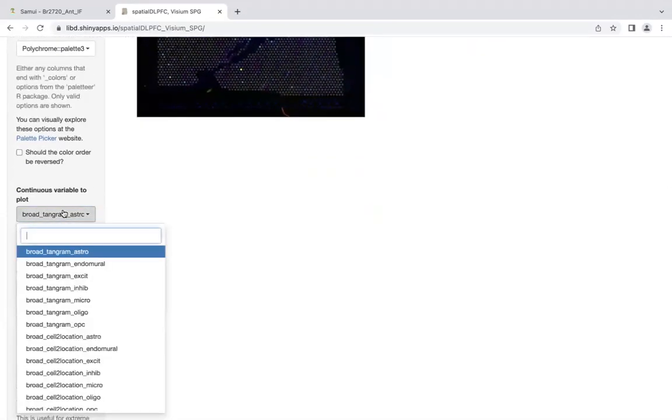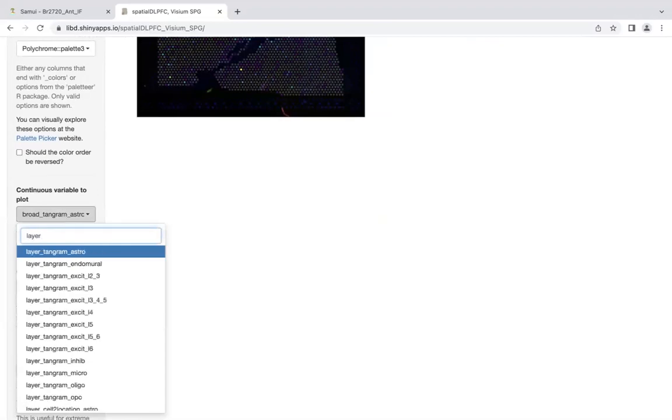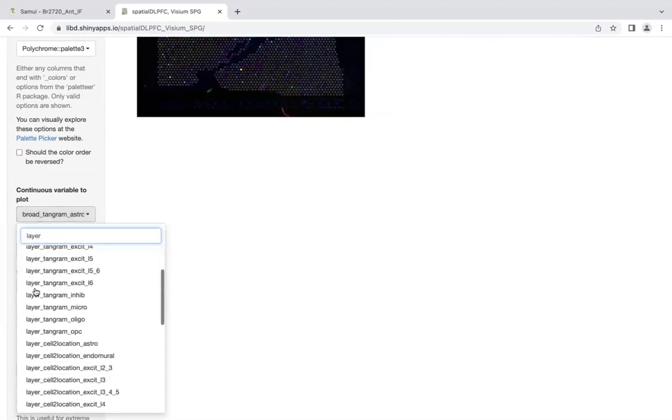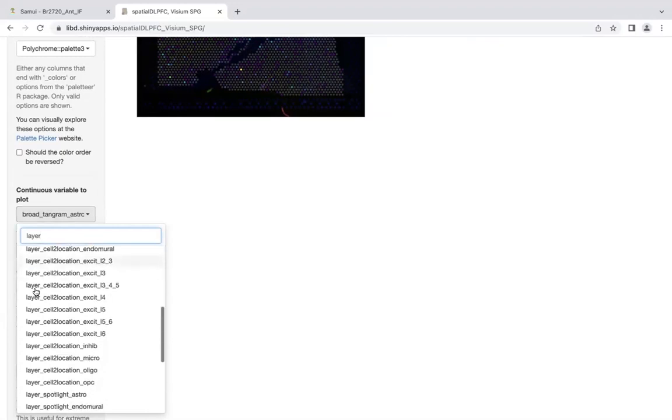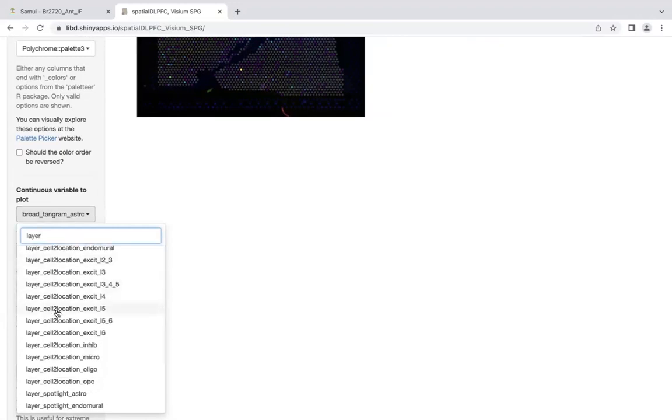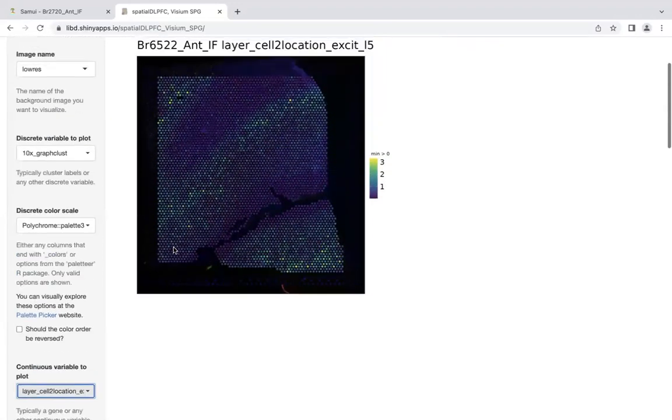Similarly, we can select which counts we want. Let's say I'm interested in the layer-level excitatory layer-5, as predicted by cell-to-location. Let's take a look here. We see this beautiful pattern.